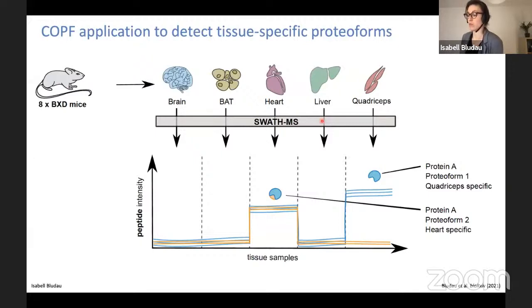And of course, SEC-SWATH-MS in itself is a strategy for stable complexes. So if you want to, for example, look at transient differences, very small differences between perturbations where you have some minor rearrangements in complexes that are not super stable, I would not recommend to use SEC-SWATH-MS, because you will see the rearrangements on the big scale.